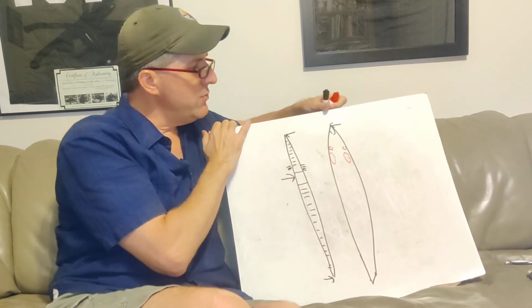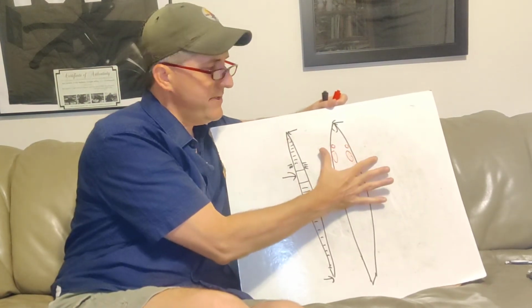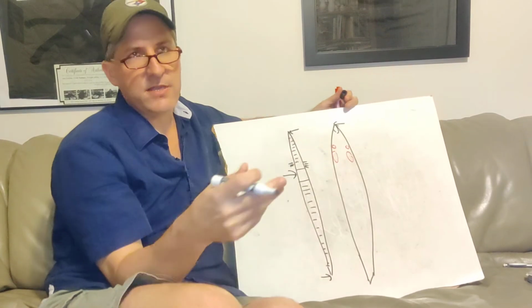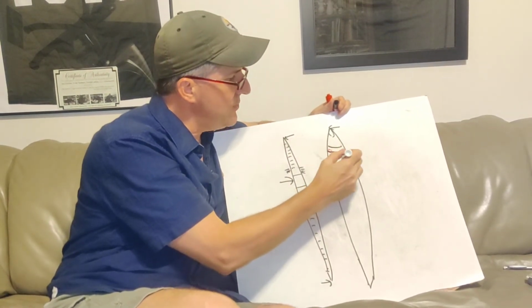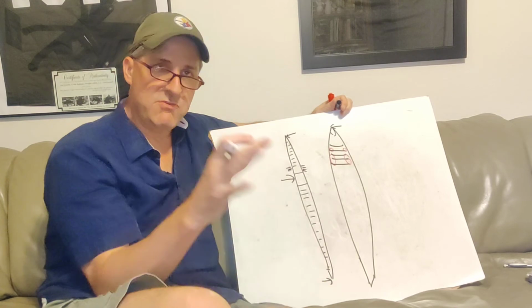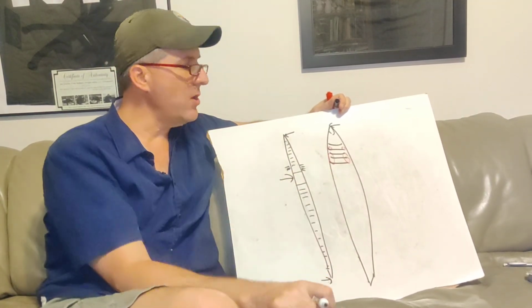What you then do is you would take these with your probe and you would basically push them to the side. When you push them to the side, directly underneath them, you would see the heart system, the cardiac system of the earthworm. There's going to be 1, 2, 3, 4, 5 ribbon-like structures that go from left to right. Therefore, there are 5 aortic arches, not like your heart that has 4 chambers. There's 5 aortic arches, but they're underneath the gonads.